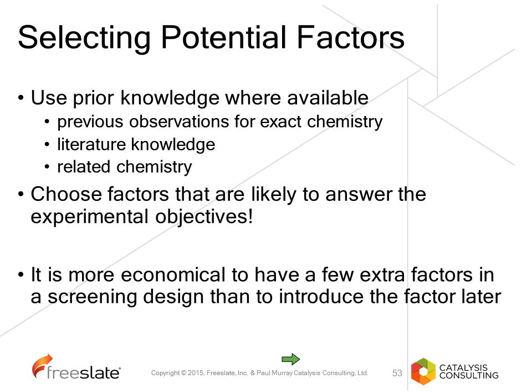If you have information about the exact chemistry, apply that. If not, you can look at literature or from other colleagues for closely related, or the exact chemistry. If you have no information on the exact chemistry, you can then move back to related chemistry. But be careful in how closely related that chemistry is, because in some chemistry, simply changing an electron donating or electron withdrawing group can completely change the outcome of the chemistry. So as much knowledge as you can apply directly from something that is the exact substrate is much more trustworthy than chemistry that you will get elsewhere.